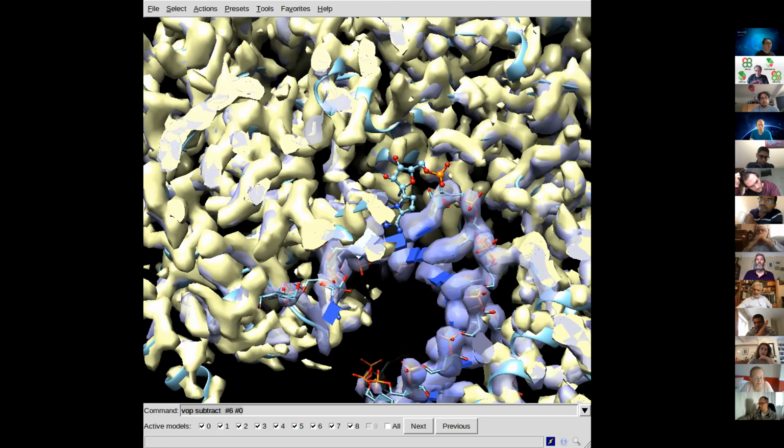Yeah, I agree with Peter. I would say at the present moment we suggest that as soon as PDB files are more or less standard procedure, and we know the scale on the PDB files, it's much easier to adjust the scale in the sense of the pixel size, but in the sense of the densities, I'm not aware if Chimera is able to do such scaling. No. Agnel's difference map can do the scaling on the amplitude. That's exactly how you will calculate the differences of maps.